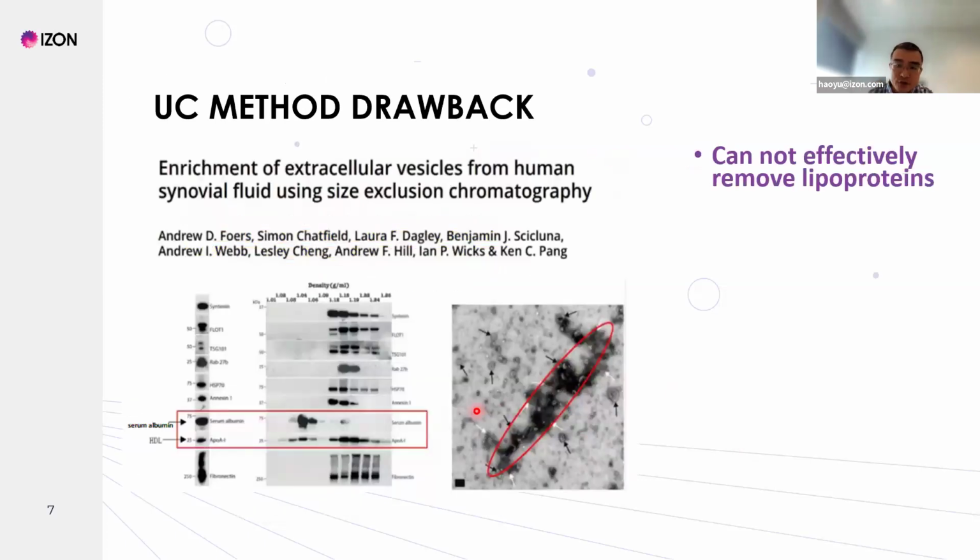Another drawback is that it cannot efficiently remove the lipoproteins, as this paper mentioned. You can see there's still a high level of ApoA1 here, and serum proteins here. You can see quite a thick band here.